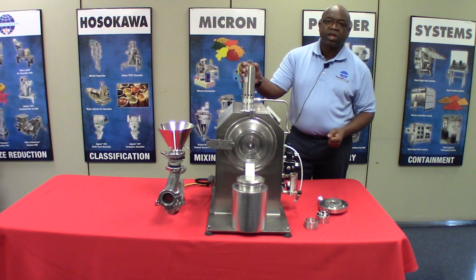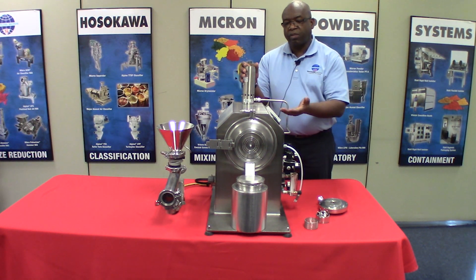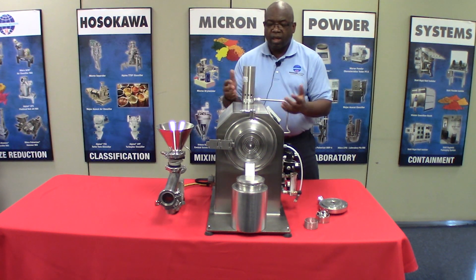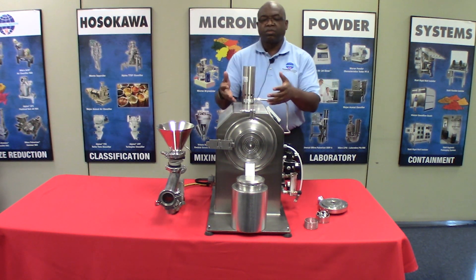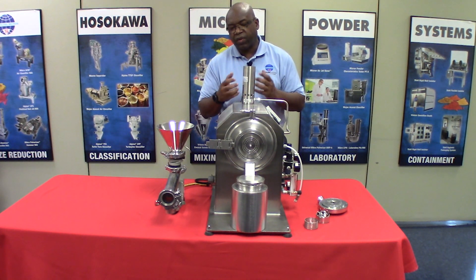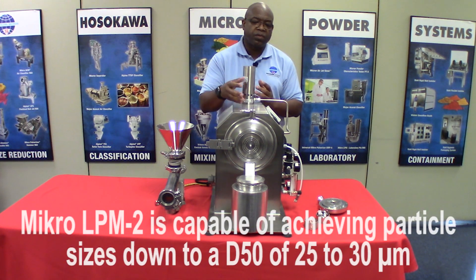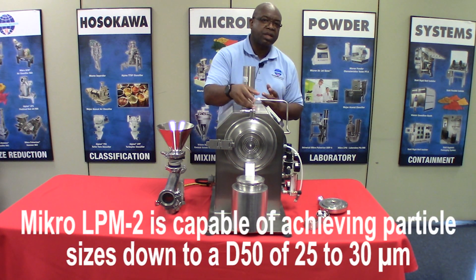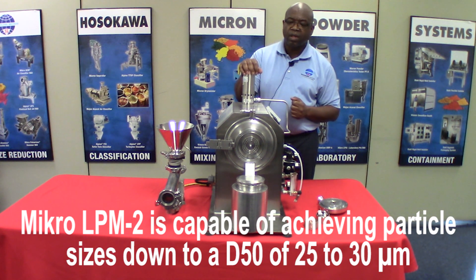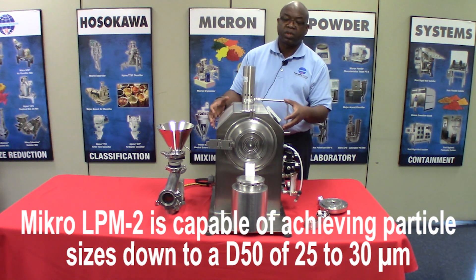This here is a vortex cooler. As mentioned previously, this mill runs at 36,000 rpm and the motor generates heat. To prevent the motor from overheating and also from heat being conducted into the grinding chamber, we can use this vortex cooler to lower the temperature within the housing.